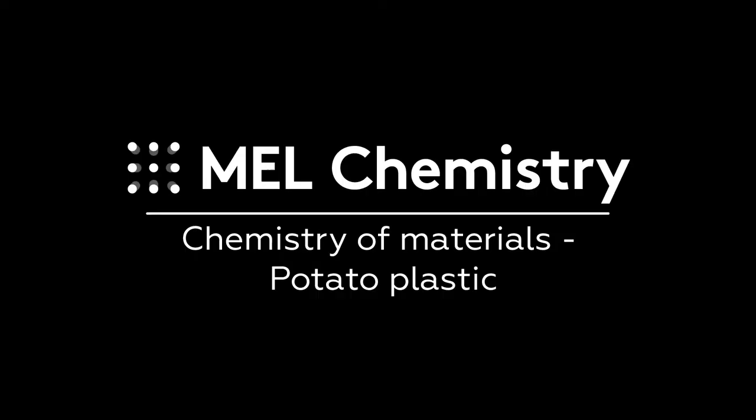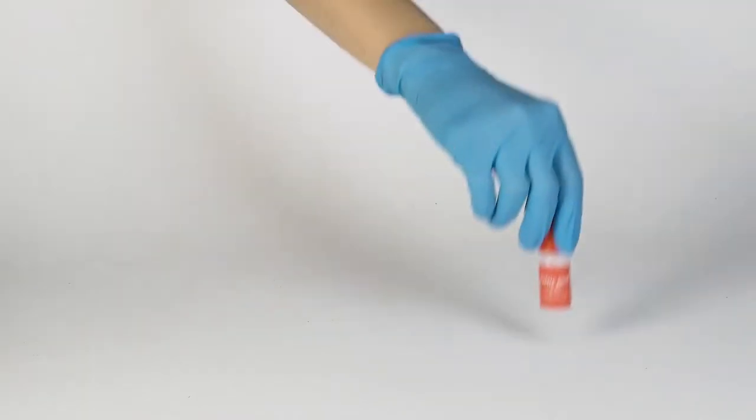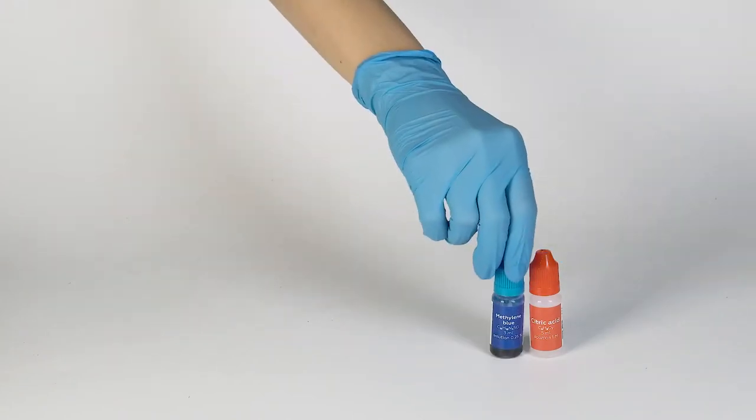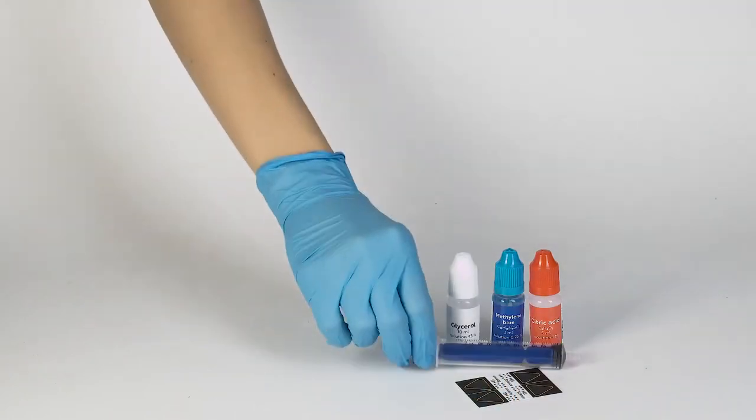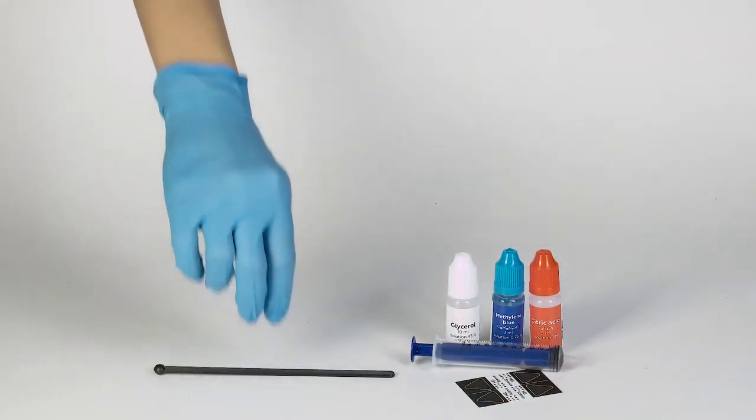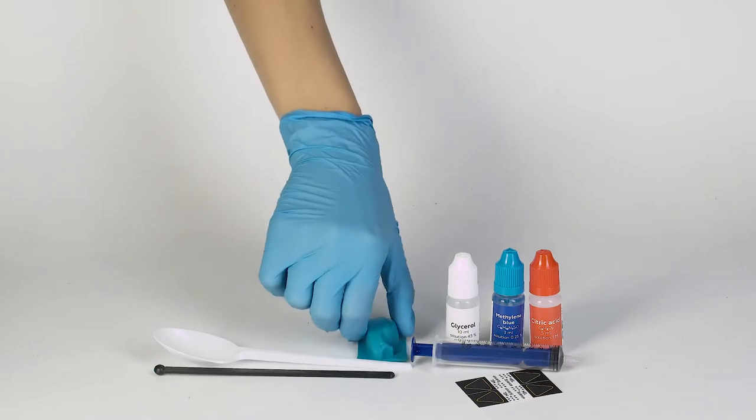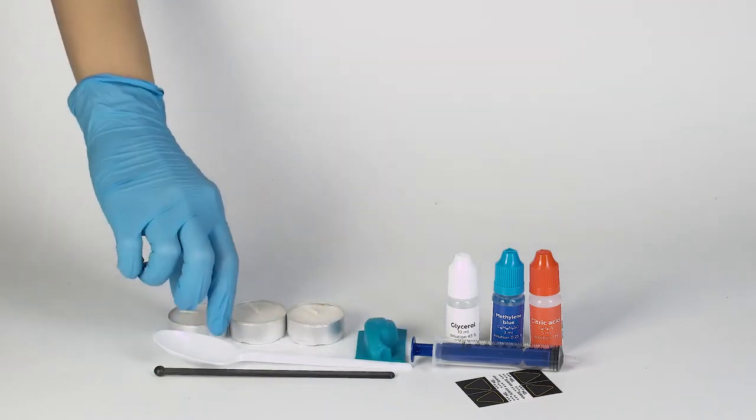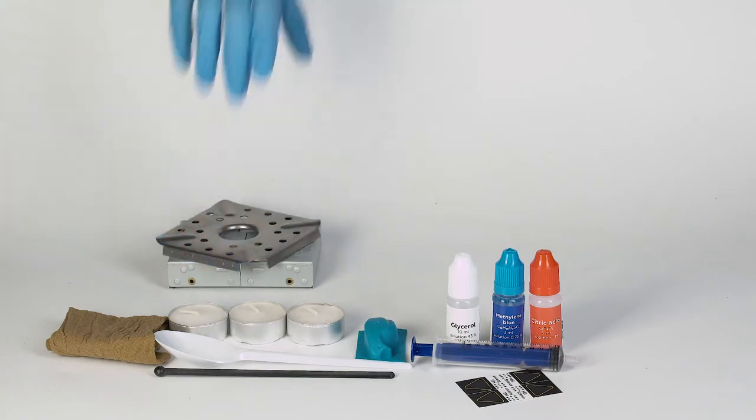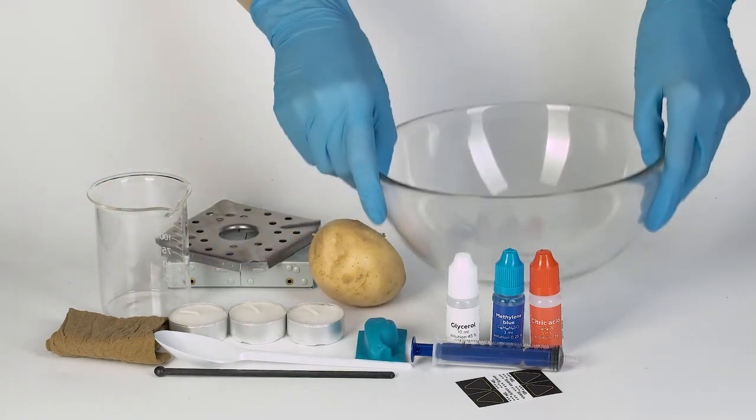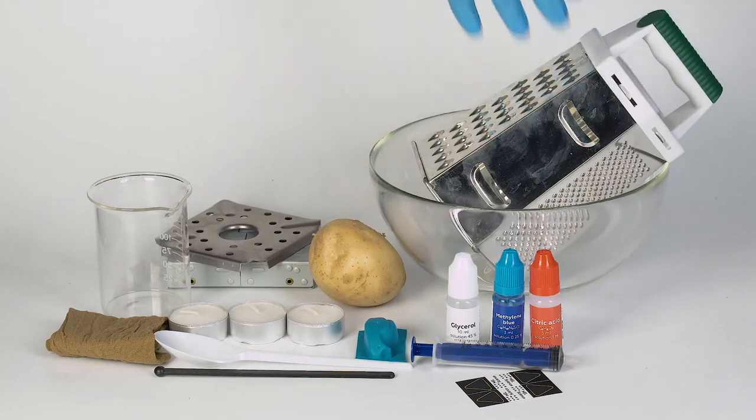For the potato plastic experiment, you will need the solution of citric acid, the colorant methylene blue, the solution of glycerol, thermostickers, a syringe without a needle, plastic stirring rod and spoon, a mold, three candles, a sock, a solid fuel stove and flame diffuser, a beaker, one potato, a bowl, a vegetable grater, and some matches.